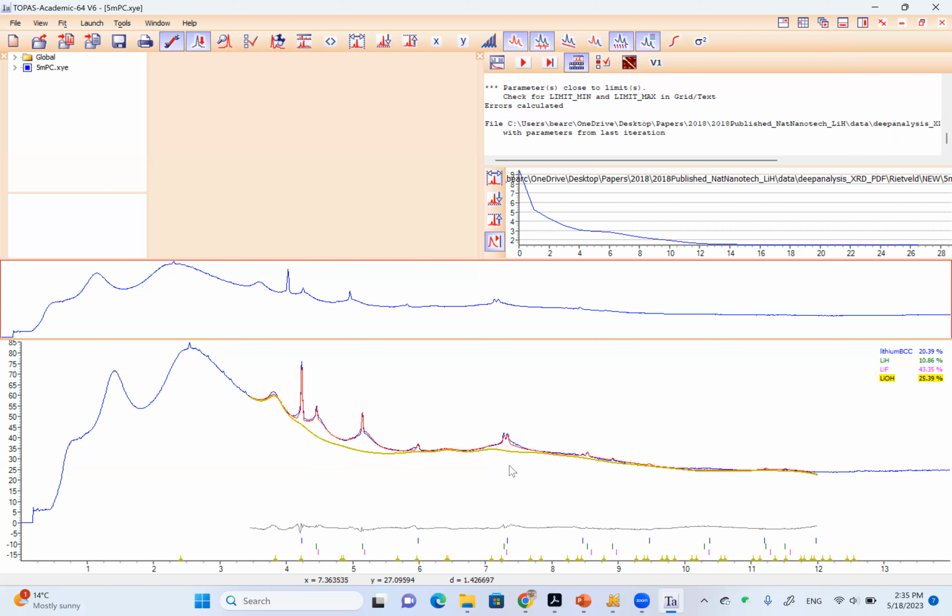It's highly anisotropic. So when you have this kind of situation, you can first just treat it as a normal phase, and the software will give you this kind of hugely broad peaks, right? At a later stage, if you realize it has this very obvious anisotropic broadening, we can consider integrating a more advanced profile function.